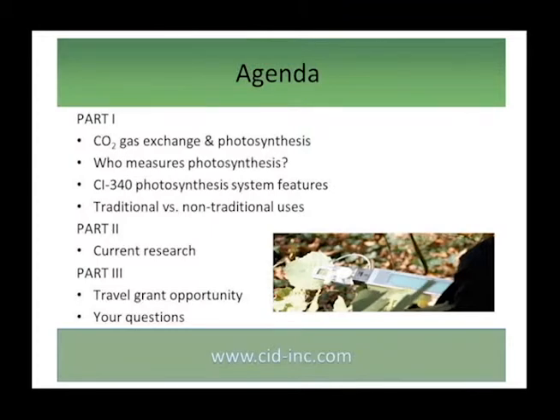Part two of the webinar will actually take up the majority of the time. This is where we'll do a review of some current research, as well as hear from a researcher who is currently using the CI340 handheld photosynthesis system. In the last part of the webinar, I'll introduce the travel grant opportunity, and then we will take questions.